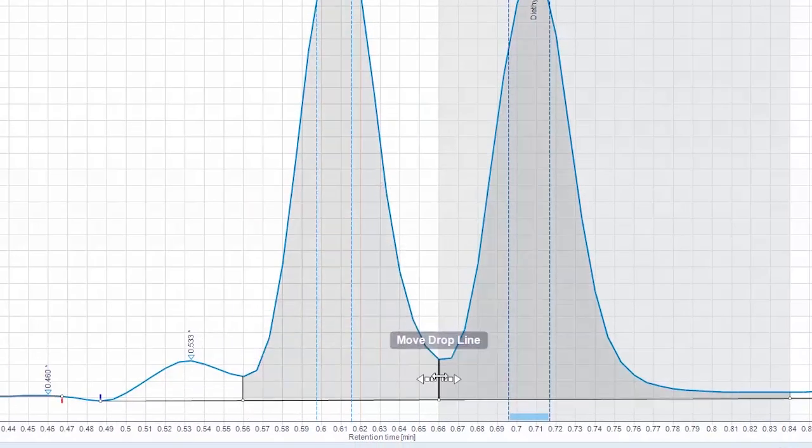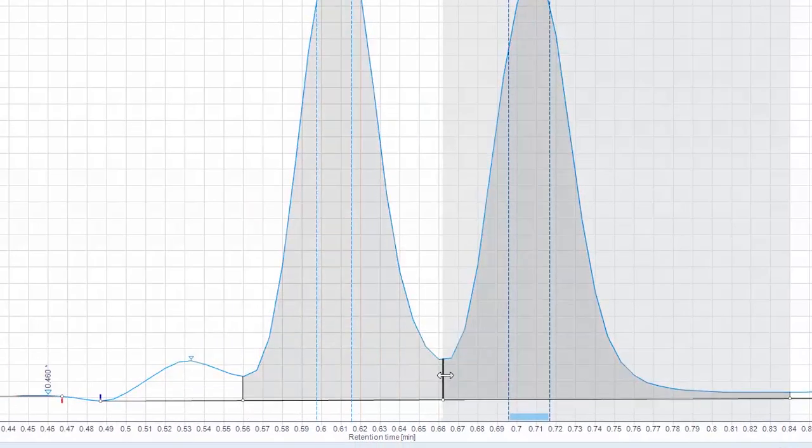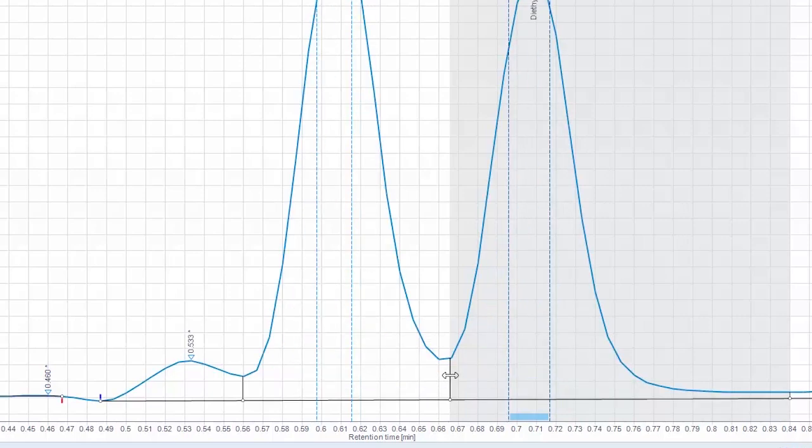Move a split peak drop line by hovering over the vertical drop line, and clicking and dragging it left or right to reposition.